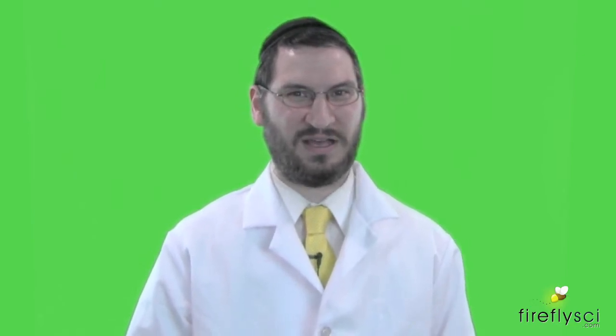Hi everyone. This is Simko Aitovich from Firefly Sci and today we're going to be doing an instructional video on how to use our FUV-1D filter. The D stands for dual purpose and this filter is meant to test for both photometric accuracy and stray light. So you can test for both photometric accuracy and stray light with one single filter. So let's jump right in and I'll show you how to use it.